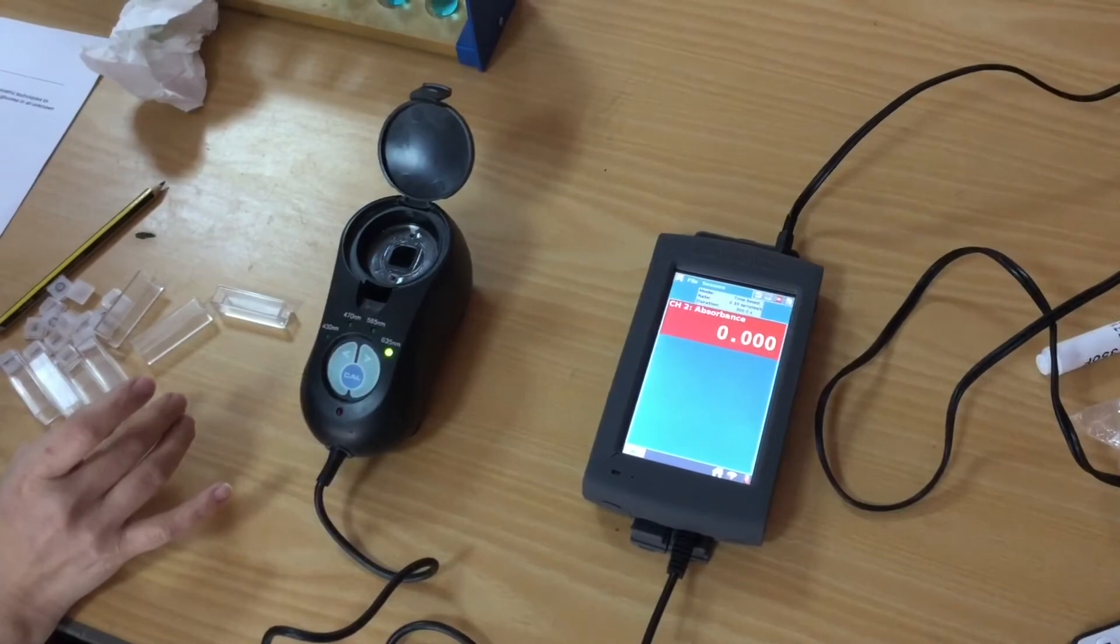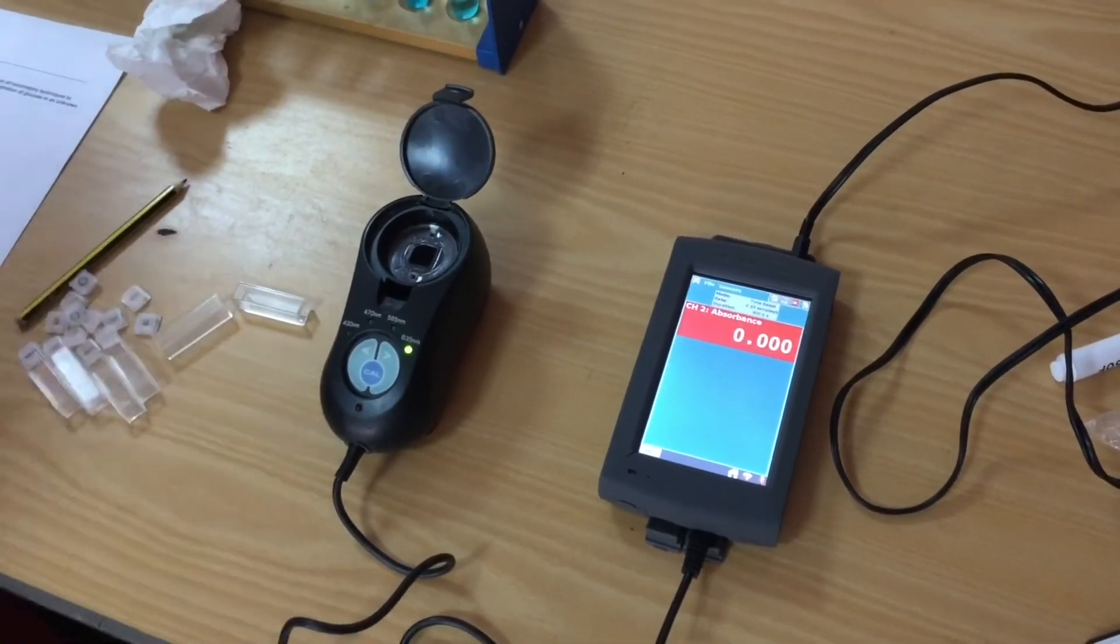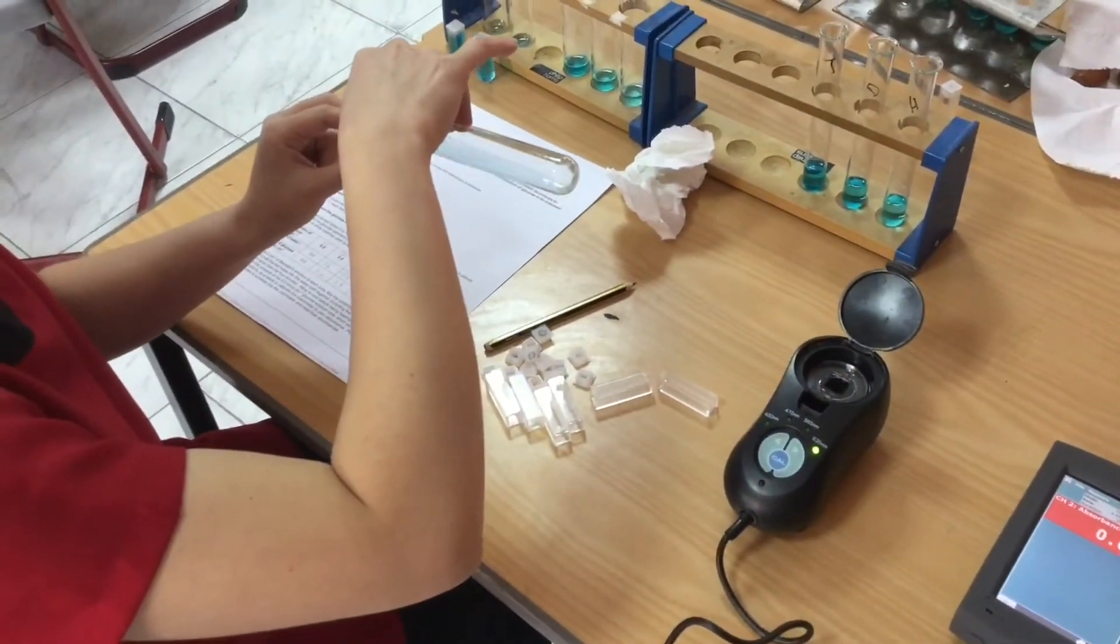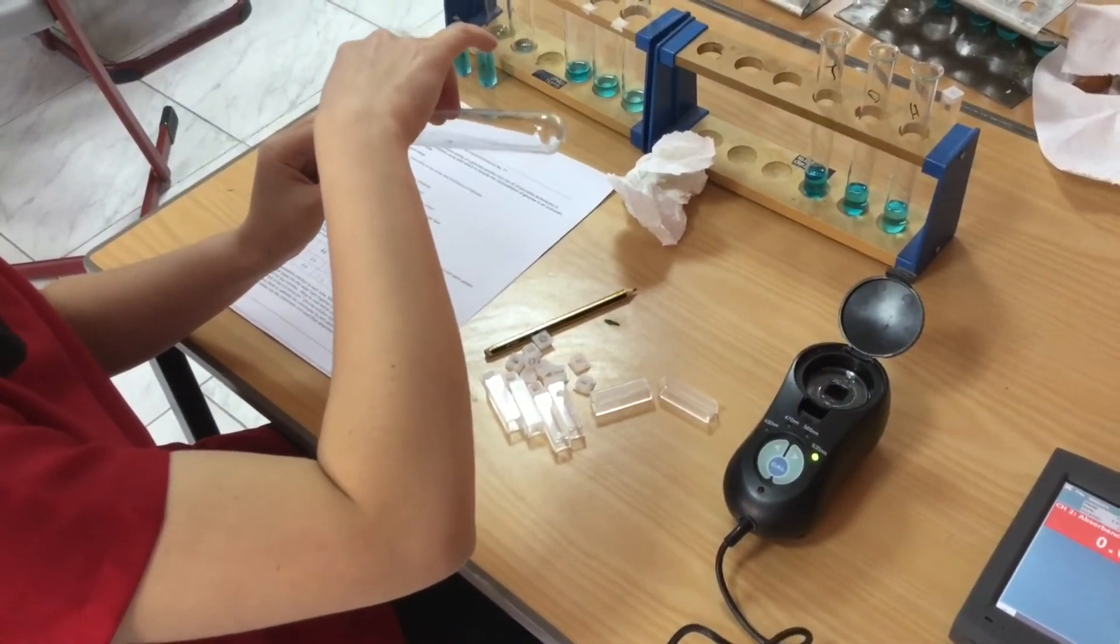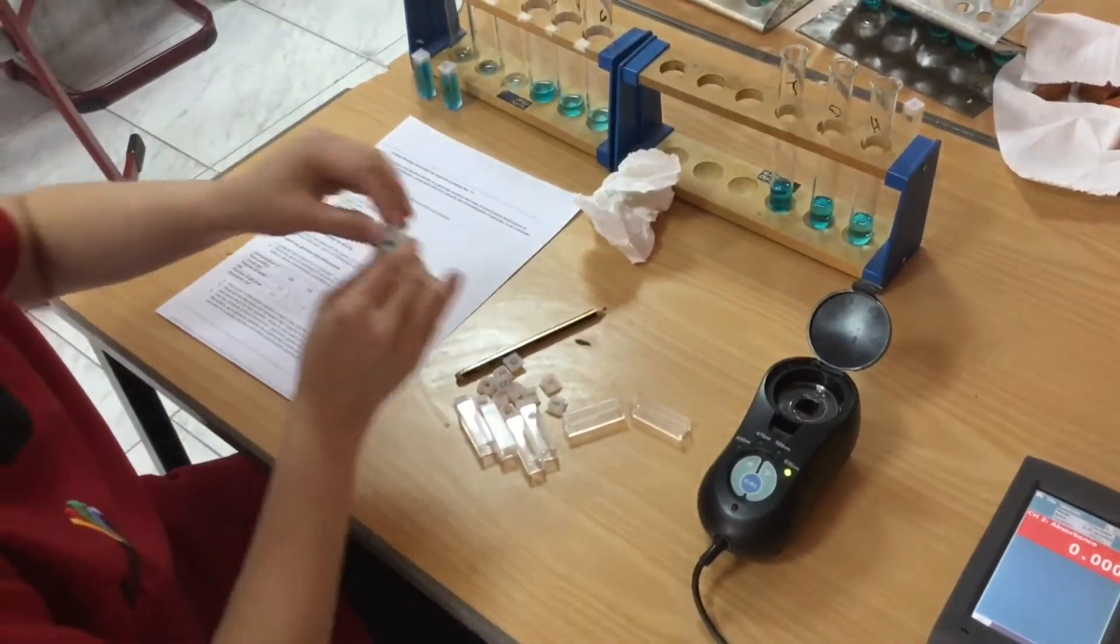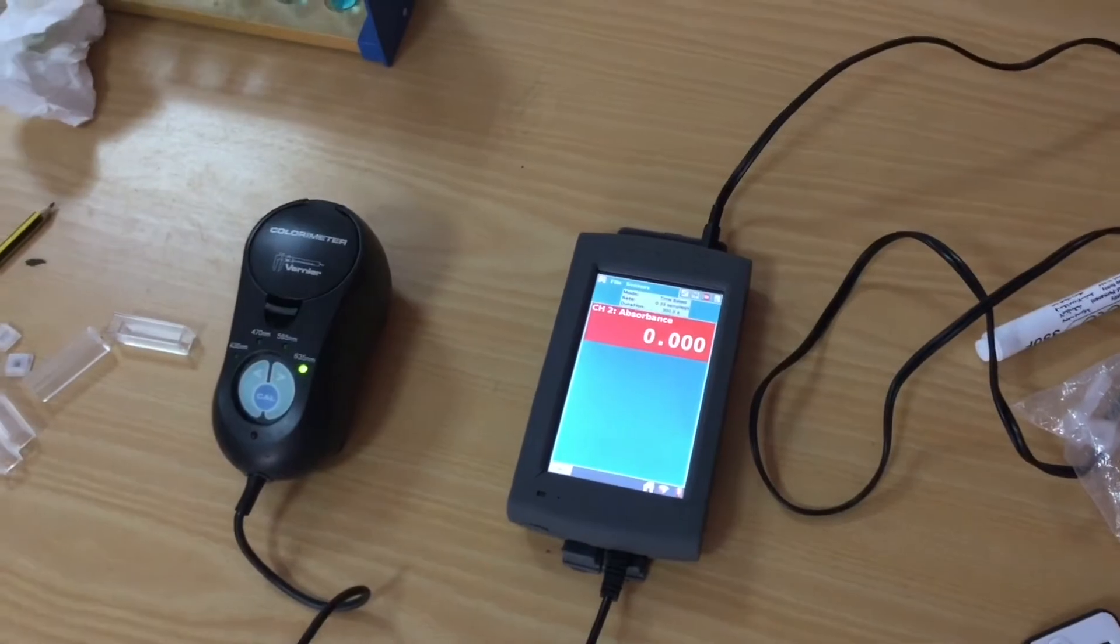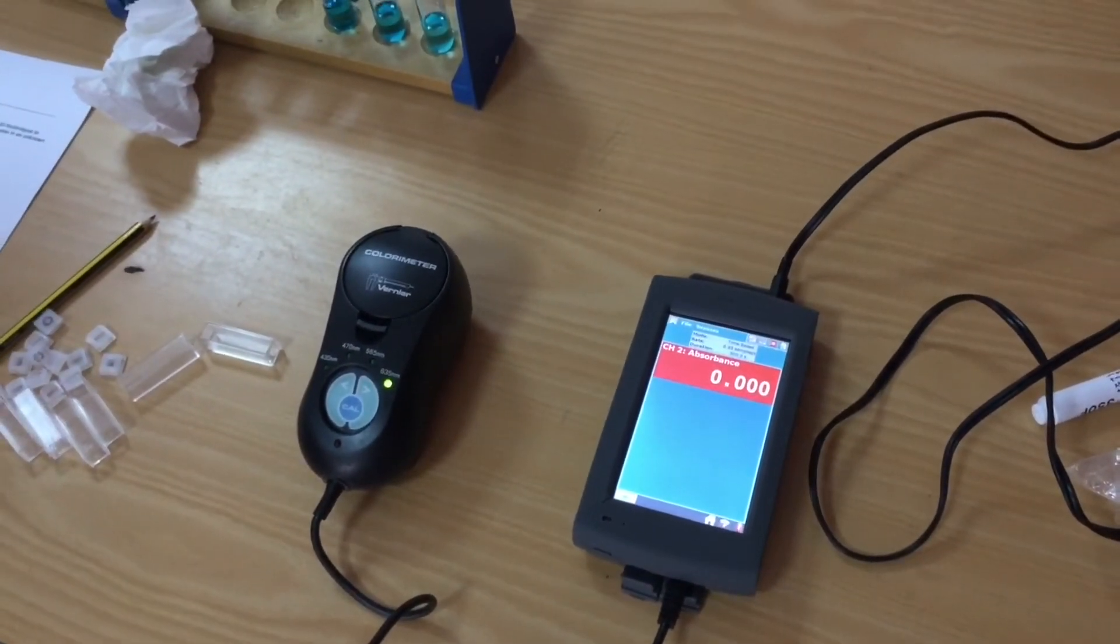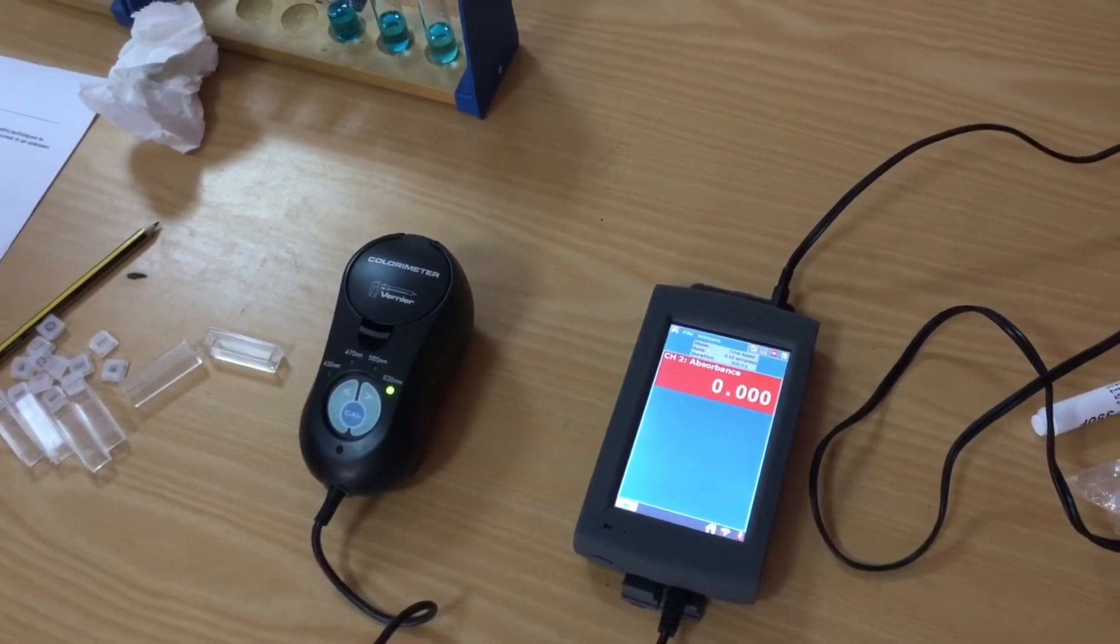I now have the results for my calibration curve which can be plotted. Remember when plotting a graph you need to use at least half of the page of graph paper. Your points are plotted with an X, not a dot. And if we can see that it's a clear linear relationship we can draw a line of best fit.